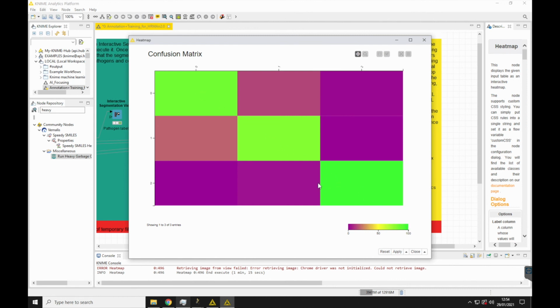Where it seems to struggle at the moment is distinguishing between unrecruited and recruited vacuoles, since there are probably about 20-25% misclassifications in this class, whereas it's already really good in singling out the artifacts. With longer training or more input images, this issue would probably be resolved.